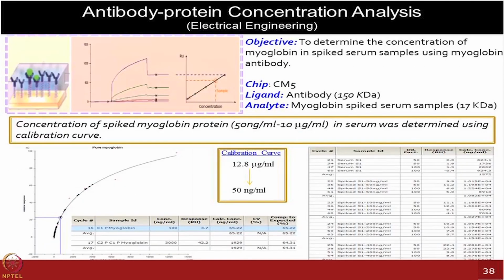Another lab from electrical engineering, their intention is to have some benchmark. So let's say Biacore technology is the benchmark available in the field. If you can measure an interaction and generate some KD from Biacore, and now you develop another biosensor and you can show that you can generate the same kind of KD, then probably you are talking about a really robust platform development, right?